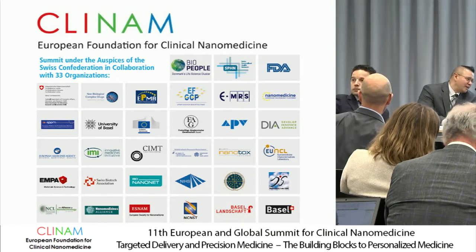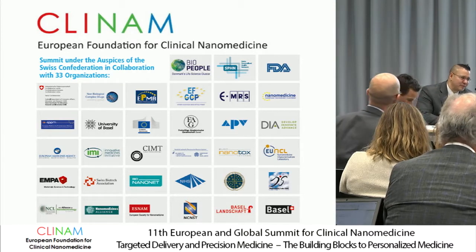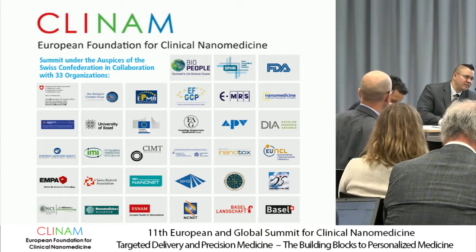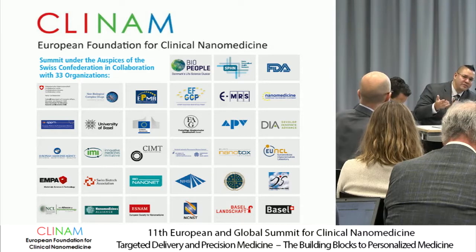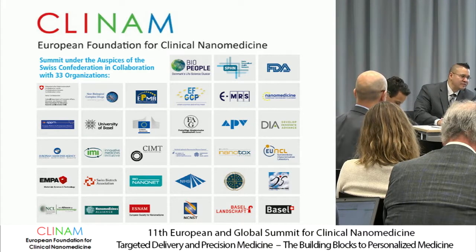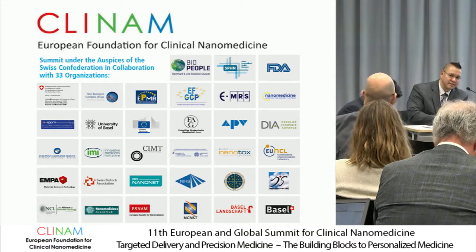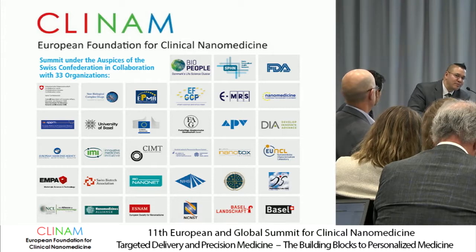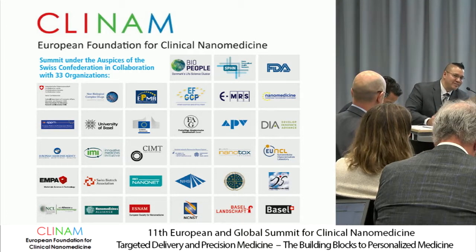Yeah, I applaud efforts where they look at parameters beyond sizing. That's a good thing, different aspects, because that's what we all try to do, obviously. And as Adriel said, you want to make sure there are standards when you run it, which I'm sure you do. You have to run references, things like that. But I'd be interested to see how those techniques can be applied to nanomedicine. Like Luigi had mentioned, hydrophobicity is something we're still trying to come up with methods for. I don't know any methods for that per se.